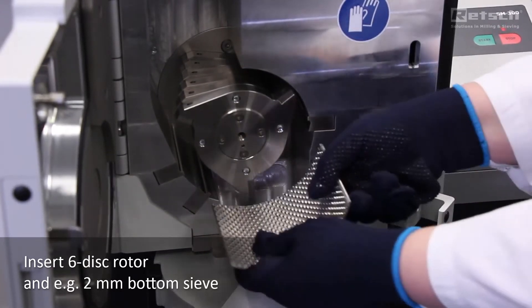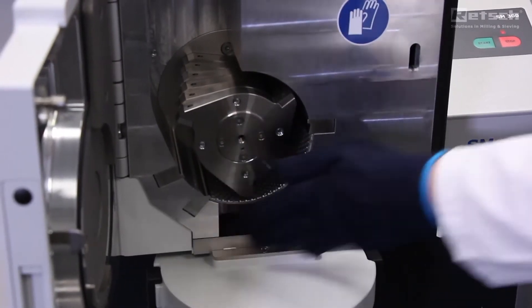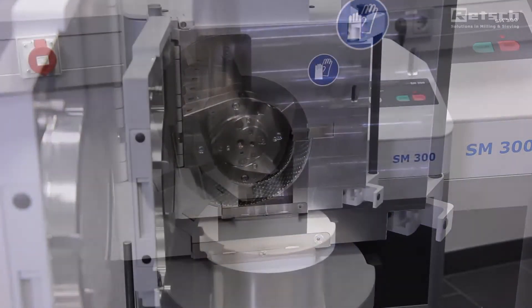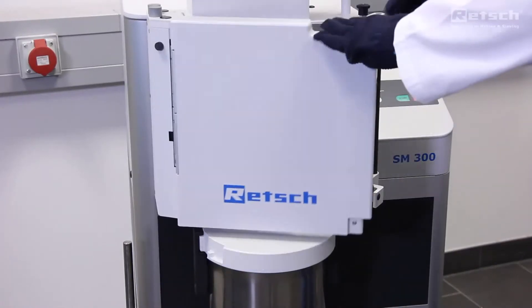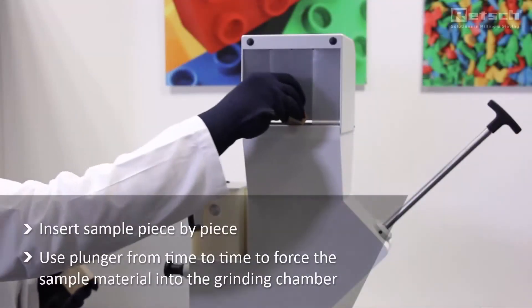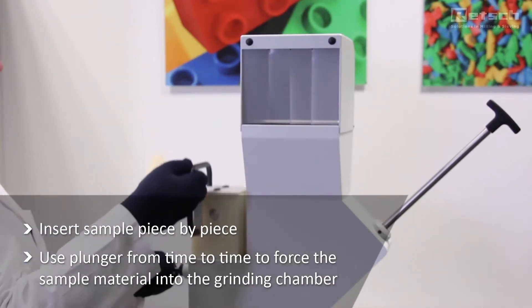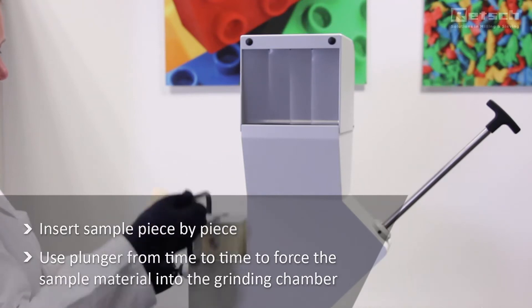We use bottom sieves without sieve cassettes, so there are no edges underneath the sieve where sample material might get trapped. With the plunger of the universal hopper, the sample can be forced against the rotor, which increases the grinding efficiency.